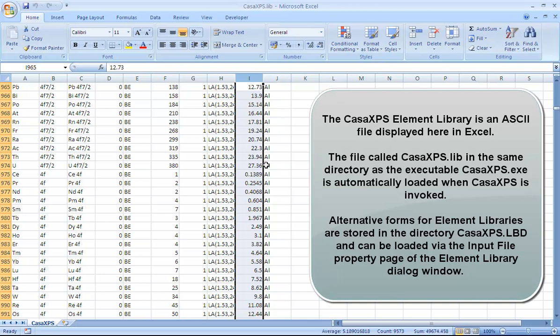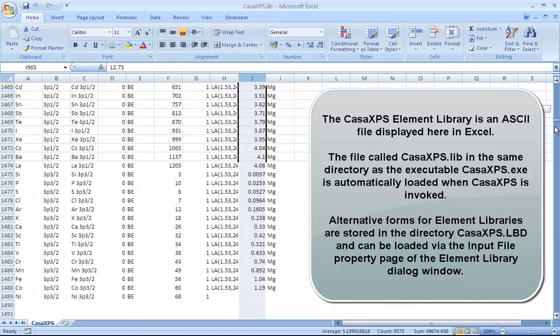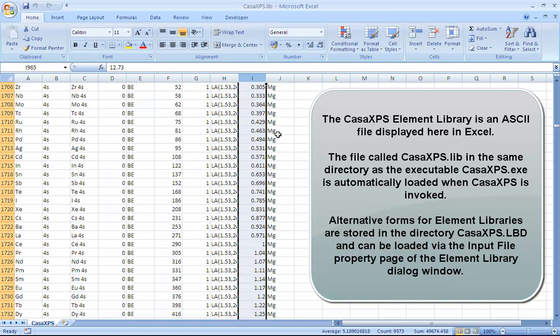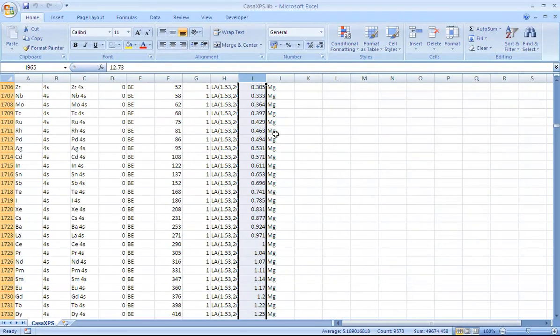These are Schofield cross sections that correspond to an aluminum anode with a given X-ray of 1486.6 eV. Within the same library, there is an entry for magnesium anode materials. This is a photon energy of 1253.6, and the RSFs are different for each one of these photo emission lines based on an aluminum versus a magnesium anode.